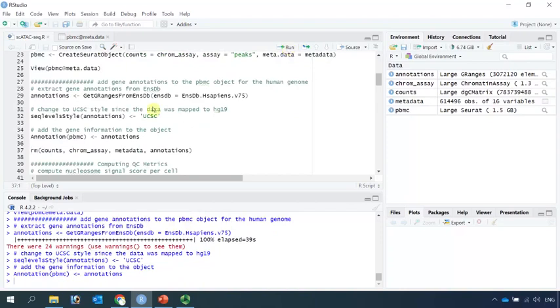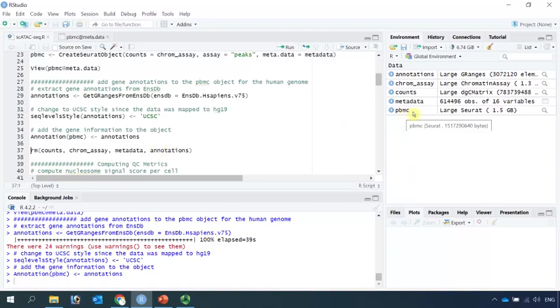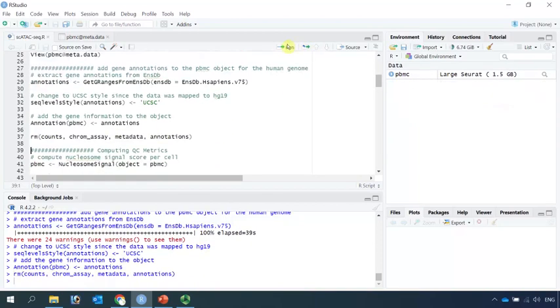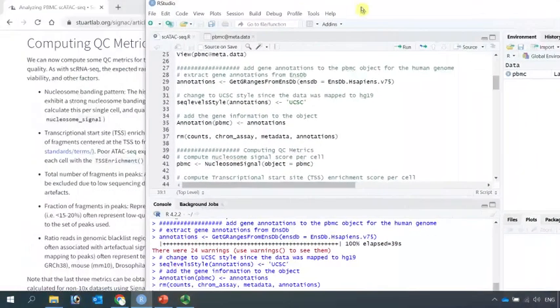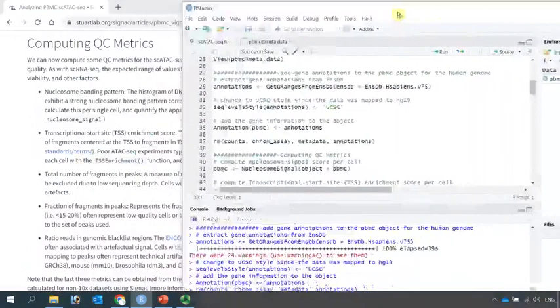We don't need the counts, chromatin assay, metadata and annotations anymore. We just need to keep the PBMC Seurat object for the rest analysis. We can remove those data. Now we have our PBMC Seurat object. We can perform the quality control analysis.